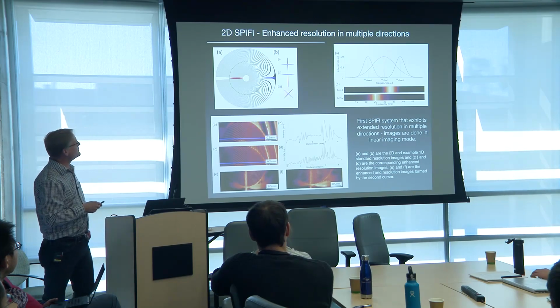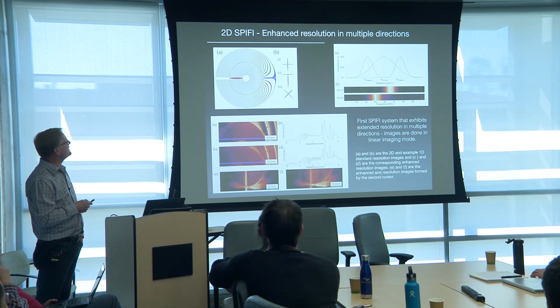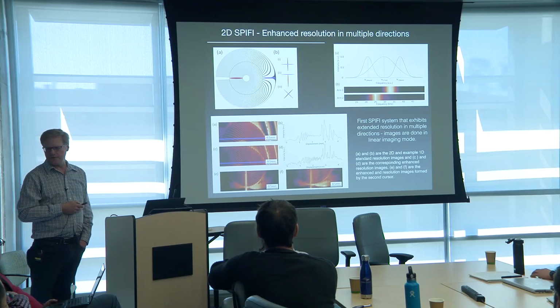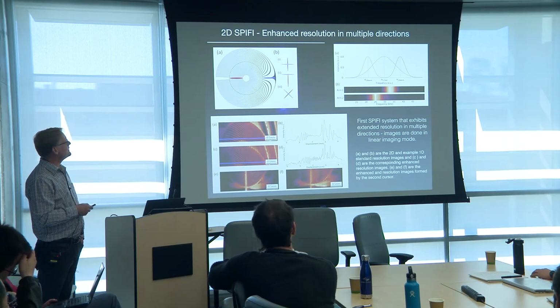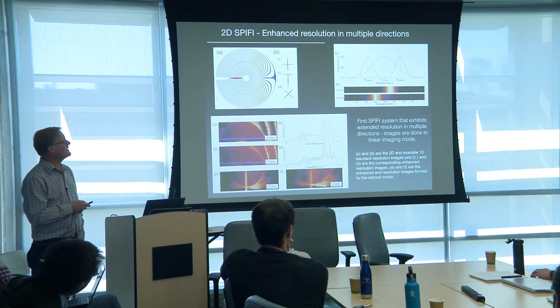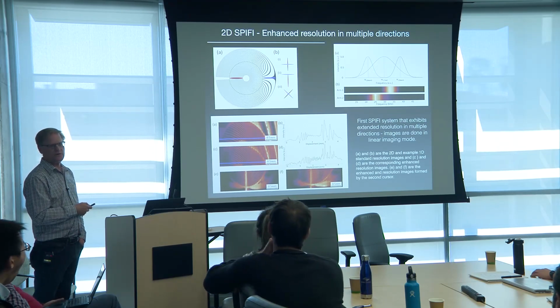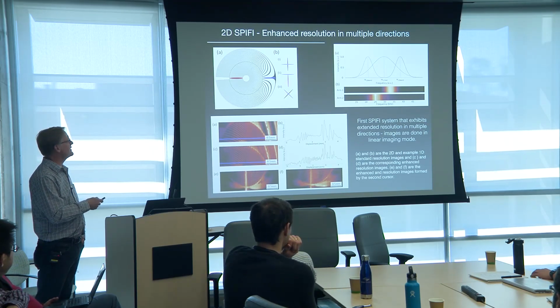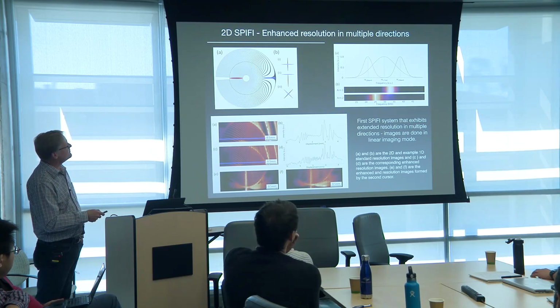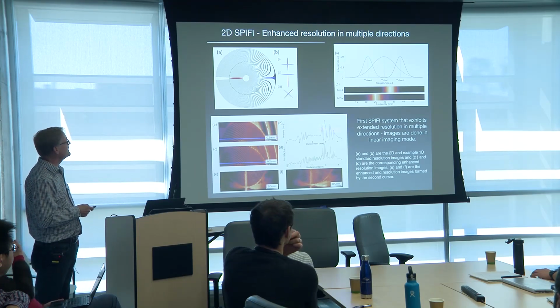So it's actually really easy to do multiple cursors in this system. In this case, we just created 2 line cursors, and we just put them at different zones within the mask. And then when we get to the focal plane, we can reposition those cursors however we want. So now I pick up high resolution along this direction with one foci, and then I pick it up on the other direction over here. And this is just showing that there's the actual images of the beam, and that they really are separated out. So the images are separated out for free.